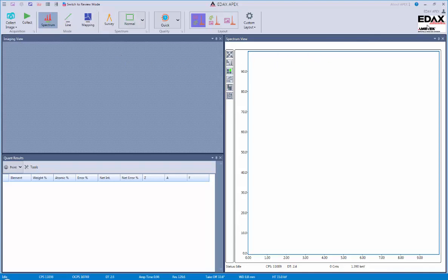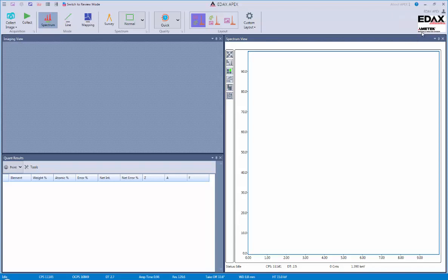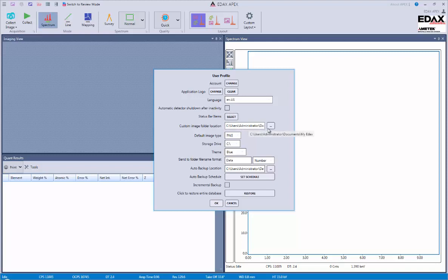We next have the user profile located over here, and we click on the EDACS APEX area to open up the user profile. This is where you can do things like change your application logo and select status bar items, turn off your detector if you're not using it, as well as change custom image folder locations, change the storage drive for where you want to automatically store your data, also change the different color scheme of our software. We can send the data to a file with a custom name or number or date, and we could also select automatic backup options.